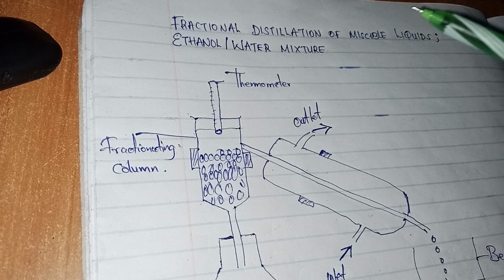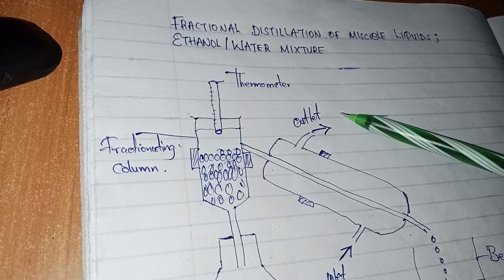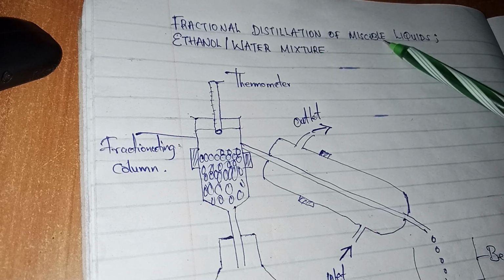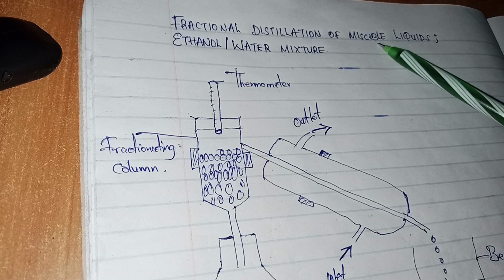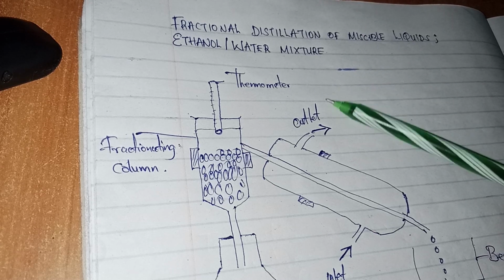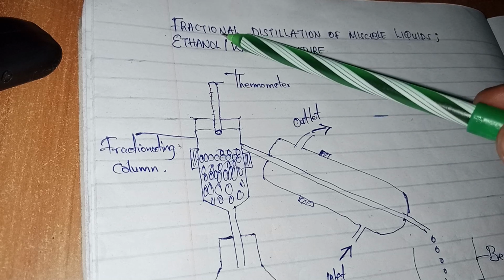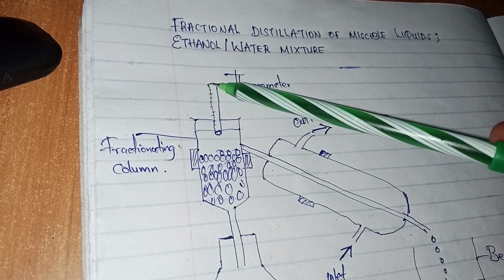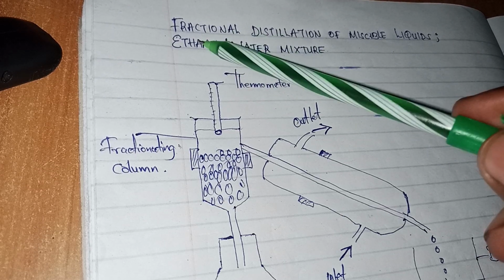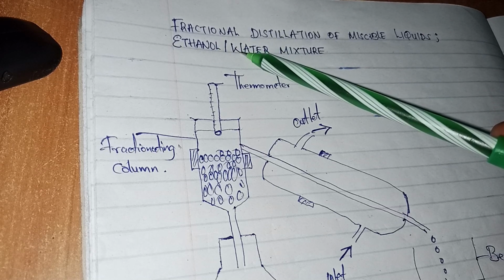An example of immiscible mixtures is maize and beans. Those we can just separate by picking. But for miscible mixtures, you'll find that it's like, maybe, milk and water, which form a uniform solution. In our case, we are going to separate ethanol from water. When you mix these two, they form a uniform mixture, right?